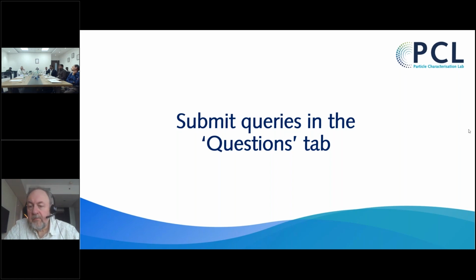Darrell, I think we have time for one or two more questions. Sure. One of them is, how reliable would you say IGC data would be when you're dealing with highly porous materials? Let's define highly porous. To give me a bit more information, do you mean high surface area or high pore volume? Just tell me a bit more. Okay, we can ask a member of the audience to perhaps rephrase that question a little bit.